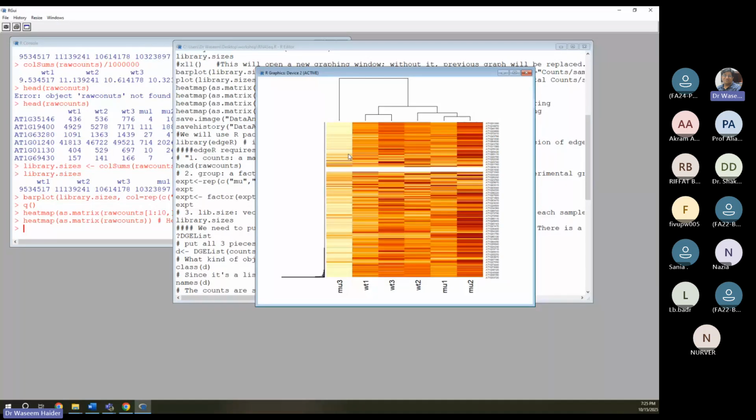So here, all those genes, again, the genes which are close in expression to each other are together. So 1300 and 8870, their expression is close to one another, and so on. If I have, for example, your class results, and I take that, and then if I make your heat diagram, so your friends, the people who are in groups, right?